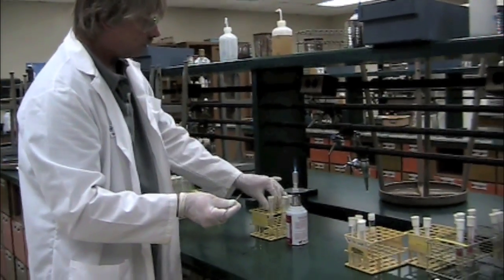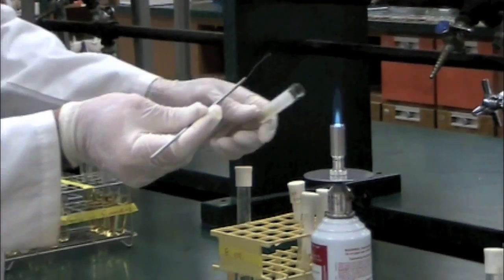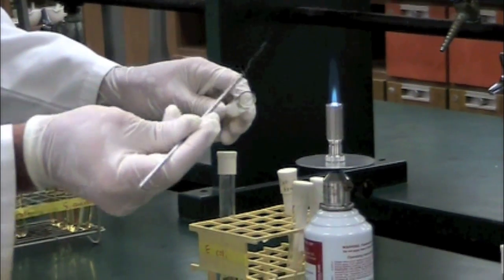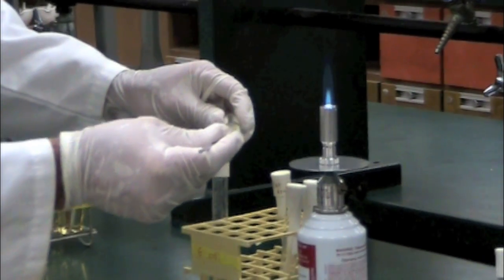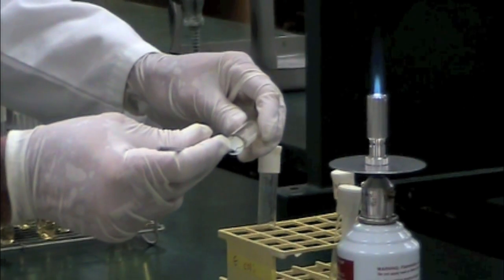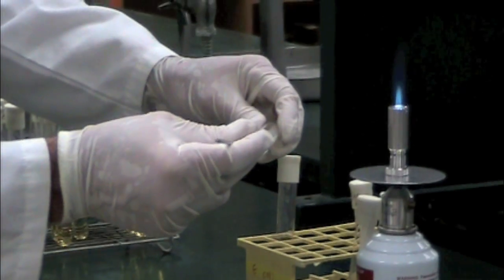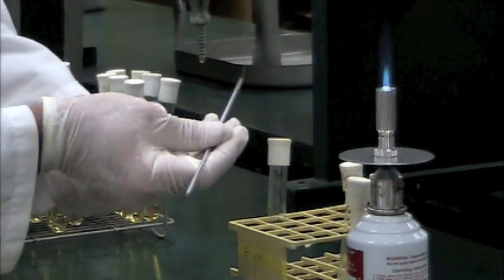Okay, I'm going to take my organism, E. coli, uncap it, flame my tube top. My loop has probably cooled enough now, but in case it hasn't, I'm going to take the loop and go in and gently rest it on the glass on the inside. And that cool glass is going to suck out the rest of the heat in that loop. You don't want to put a hot loop on organisms and fry them, okay? You can't get an effective transfer if you do that. So now I'm going to get my inoculum, reflame, okay?